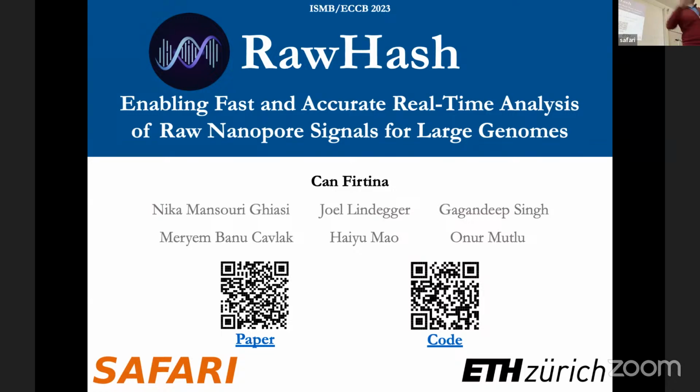It's not simply that you first start sequencing a viral genome and then there comes bacteria, then there comes a human. The assumption is that all the reads from any organism can be sequenced at any point. So there is that randomness, and that's why we can make such dynamic decisions.